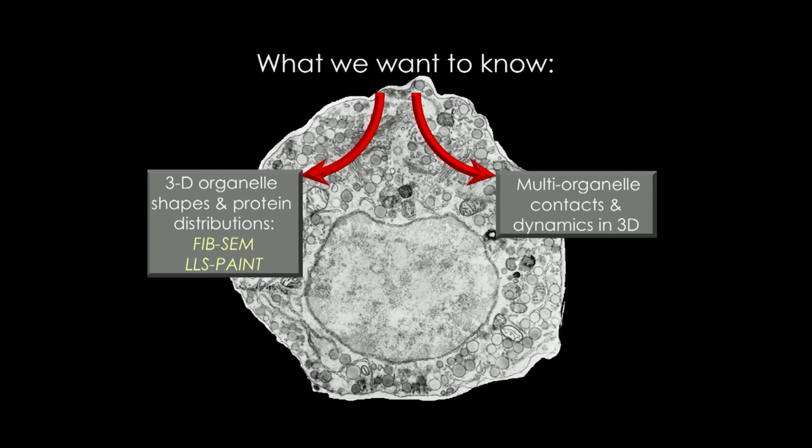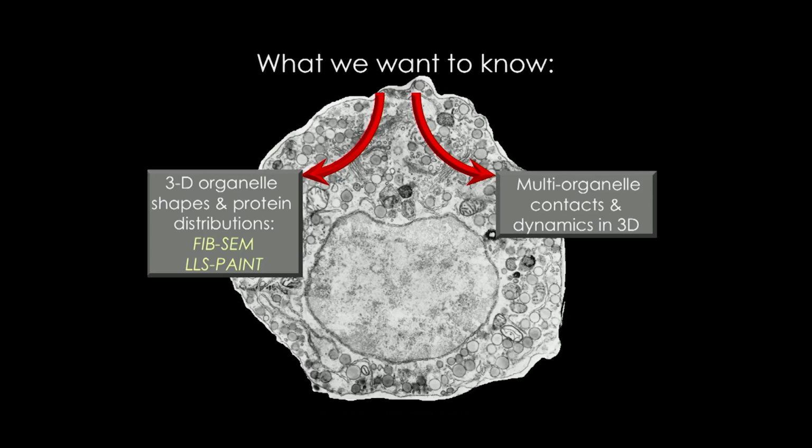In particular, that's important for understanding how different organelles are contacting each other and communicating with each other. We know, for instance, the endoplasmic reticulum, which is this sort of snake-like structure that you can see in this EM image, is contacting virtually every other organelle within the cell and communicating with those organelles through lipid trafficking, essentially exchange of reactive oxygen species, calcium signaling, many other types of communication going on between these organelles.